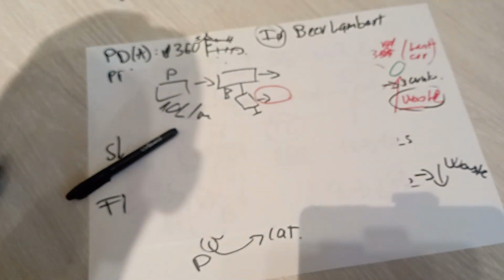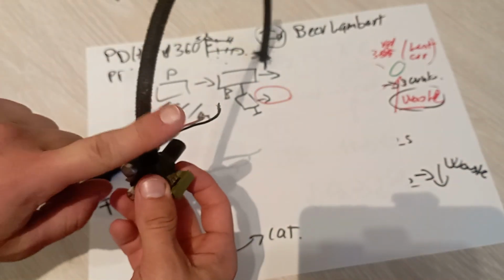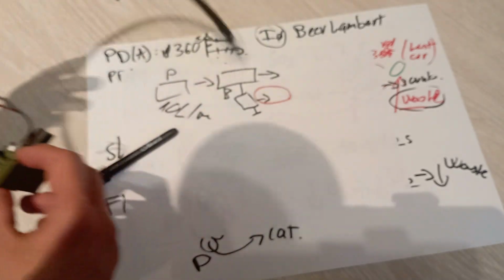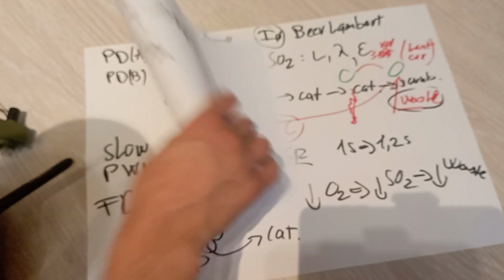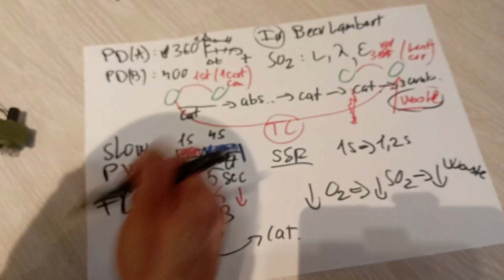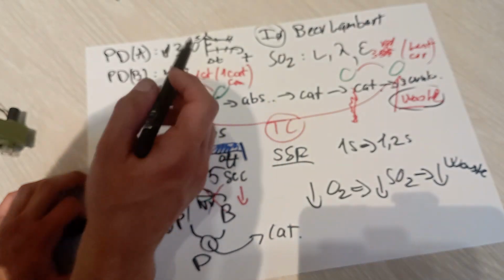actually. It has not been heated up yet. And guess what I do? I pump this into here and into there, which is very important because after the catalyst, there is, as I said, 400 degrees Celsius.